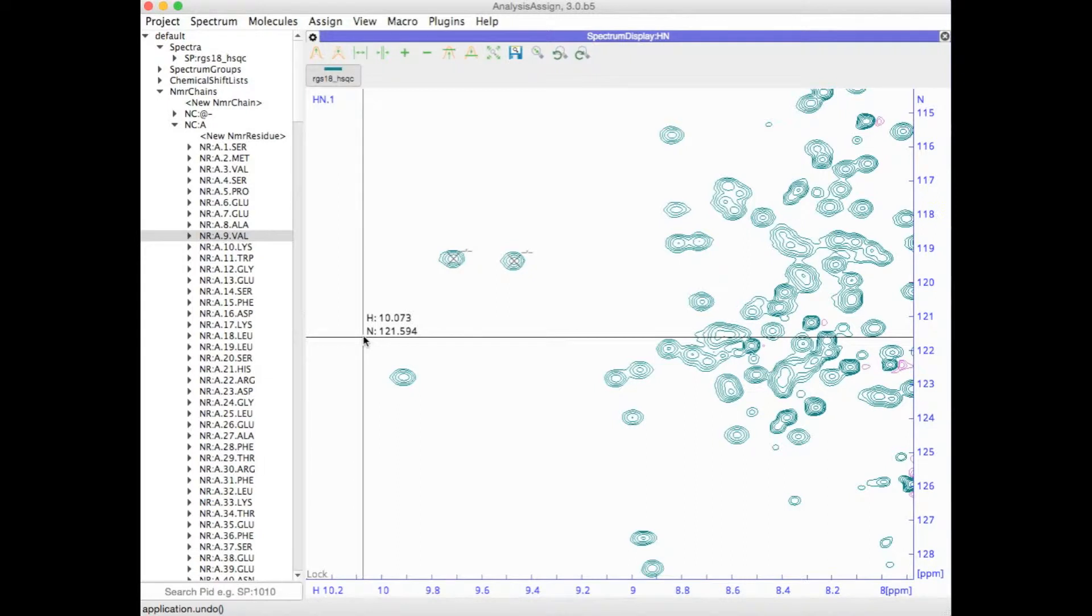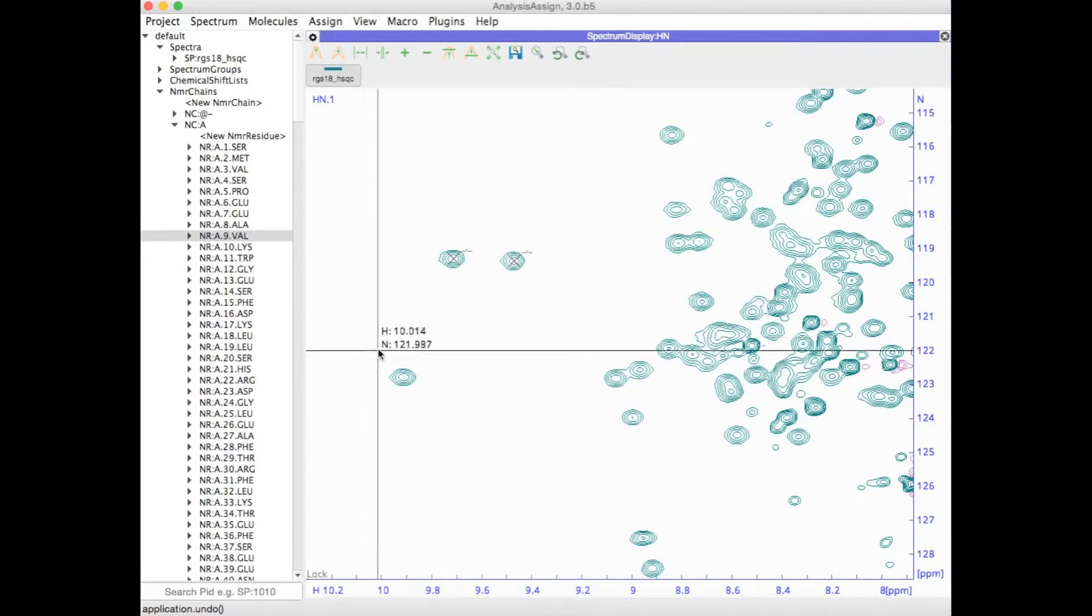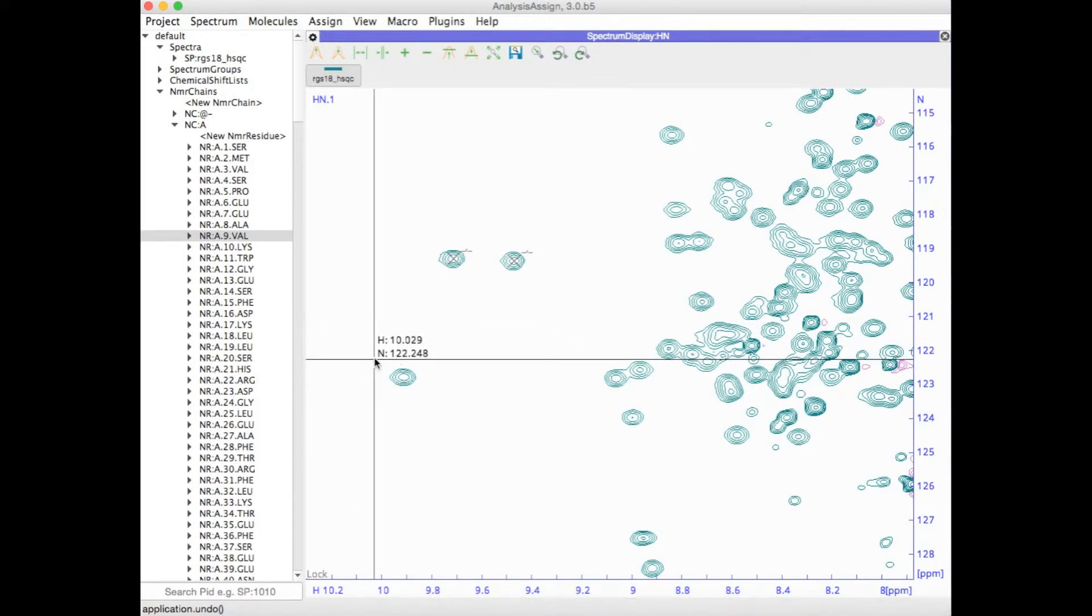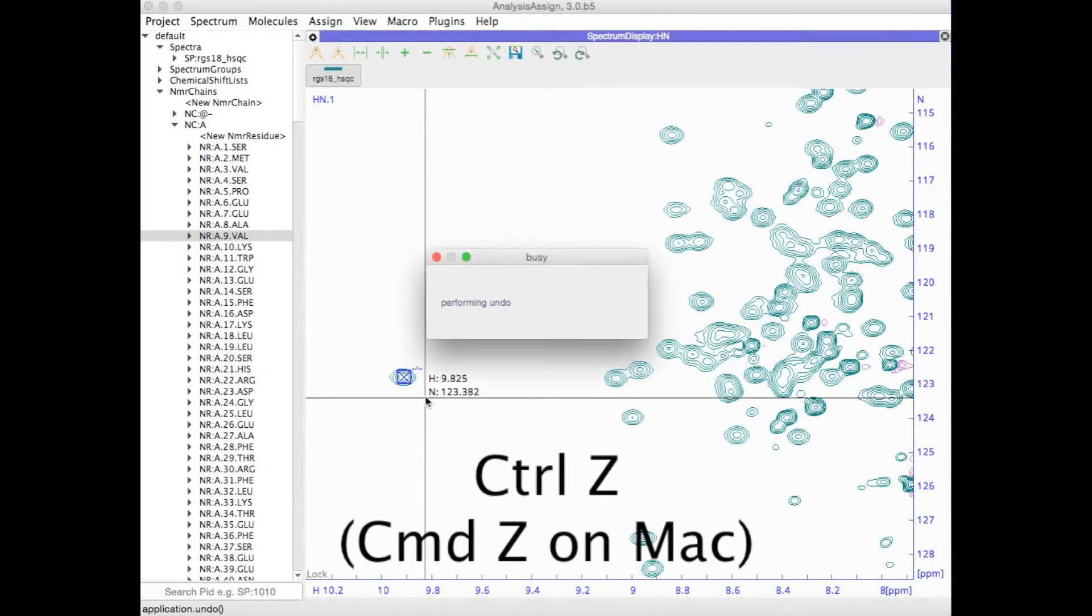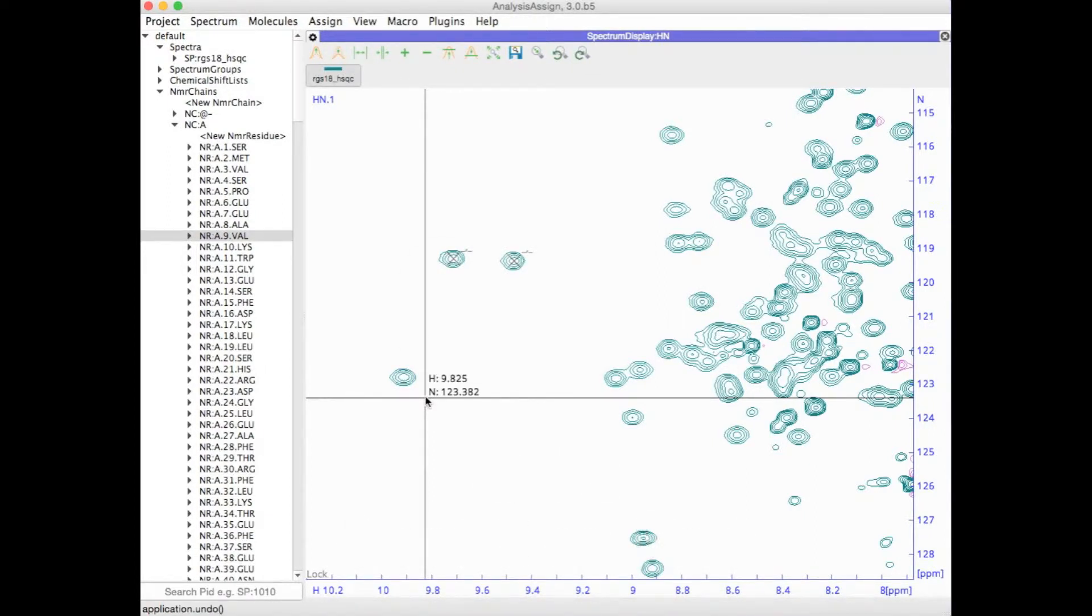Analysis finally has an undo button. If you have created a peak which you didn't mean to create, simply type Control Z or Command Z on a Mac and it will undo that.